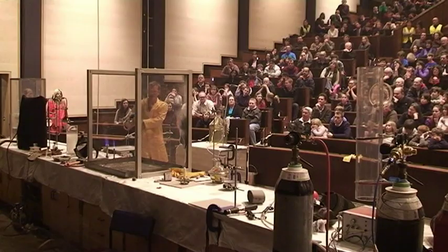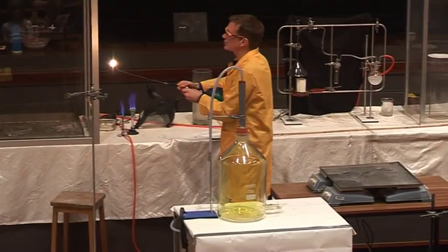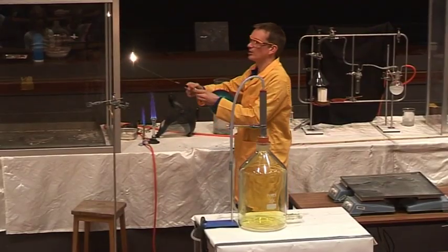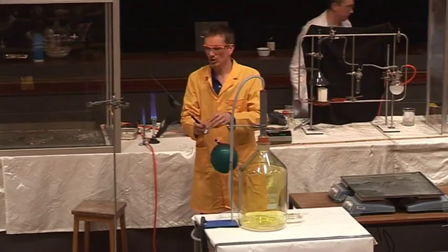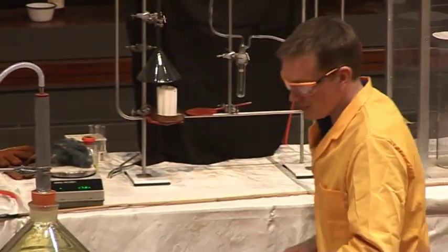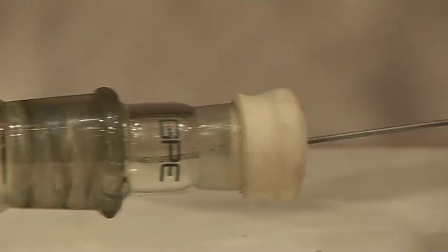And this burns. I should be able to set fire to this. Okay, it burns. Very smoky flame here. Okay, but I need to start this by putting it into the Bunsen flame to get it to burn. So this is acetylene or ethine. So it's 2 carbon atoms and 2 hydrogen atoms in each molecule of this gas. Now, I'm going to put this into the chlorine. So there's no oxygen at all in this.